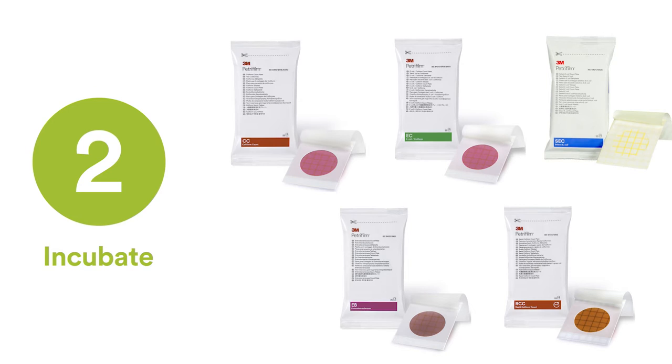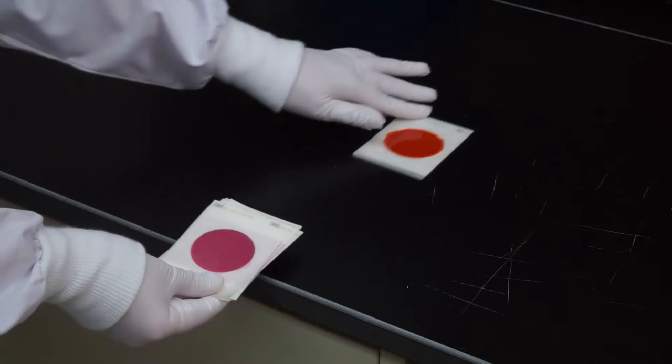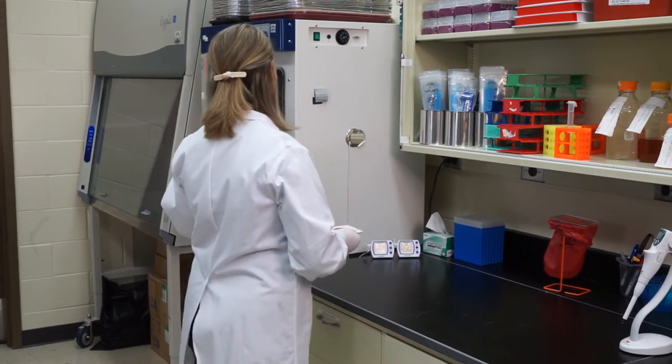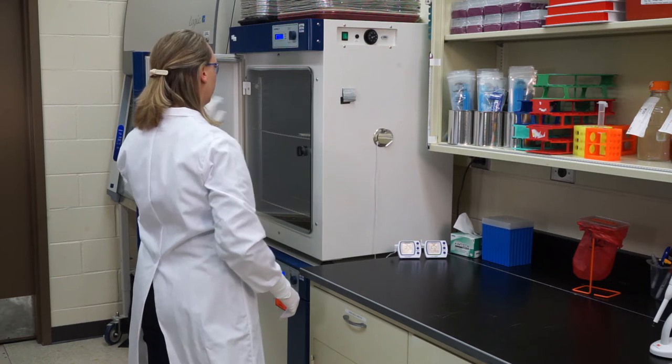Step two: incubate. A compact incubator is ideal for 3M Petrifilm plates because no bulky agar dishes or instruments are needed. 3M Petrifilm plates contain two layers of thin film, providing a space-saving size that requires less storage and less incubator space.